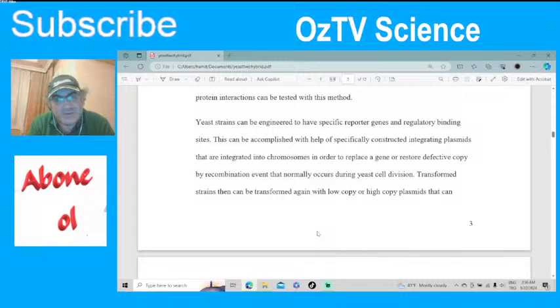Yeast strains can be engineered to have specific reporter genes and regulatory binding sites. Reporter gene means that if you turn the gene on, it generates an enzyme or changes color. It's called a reporter gene. It's not as significant as metabolic activity. It's just a gene that tells you it turned on. And regulatory binding sites: if you have a reporter gene, you can play with it like a switch box. You can change how to turn the gene on and off, etc.